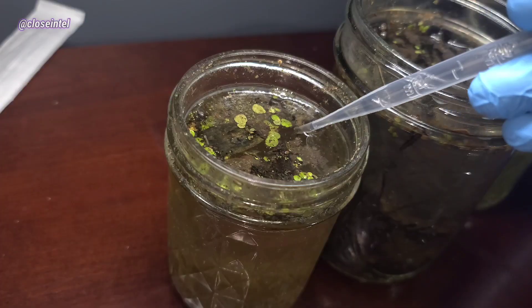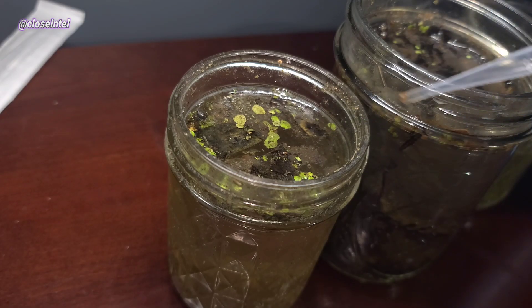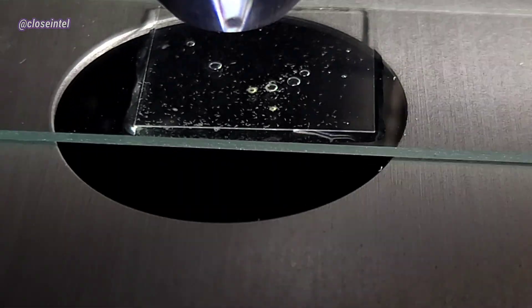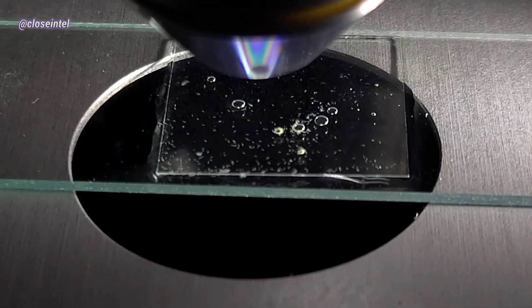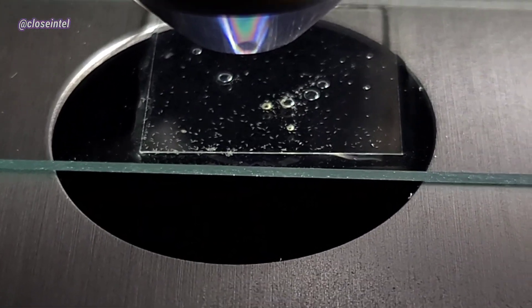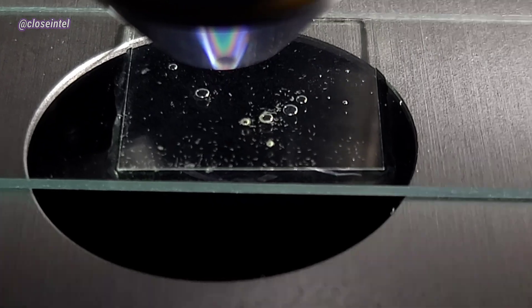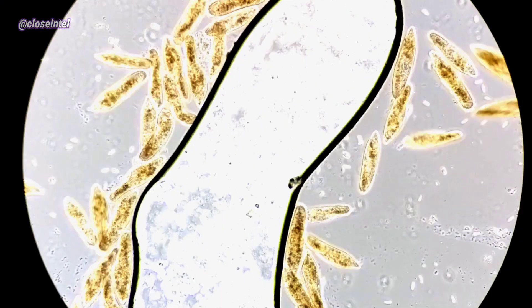With no movement or aeration, this stagnant water has become a breeding ground for a bunch of biofilms and bacteria. Before I show you what's in the sample I just took, I wanted to show you the slide itself. You can see so much movement going on. Alright, let's take a look.